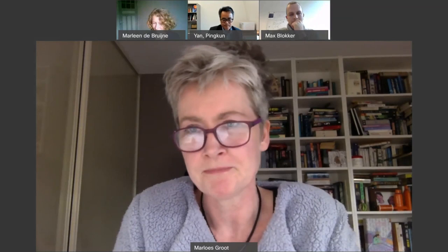Okay, thanks. And maybe actually for Ming Zhou, because Ming Zhou is working on the development of this needle. A drawback for the needle is, of course, that it will always have a limited field of view, and probably the image quality will not be as high as the images that I just showed you. And then an AI algorithm could help in enhancing the contrast in these images of a needle.